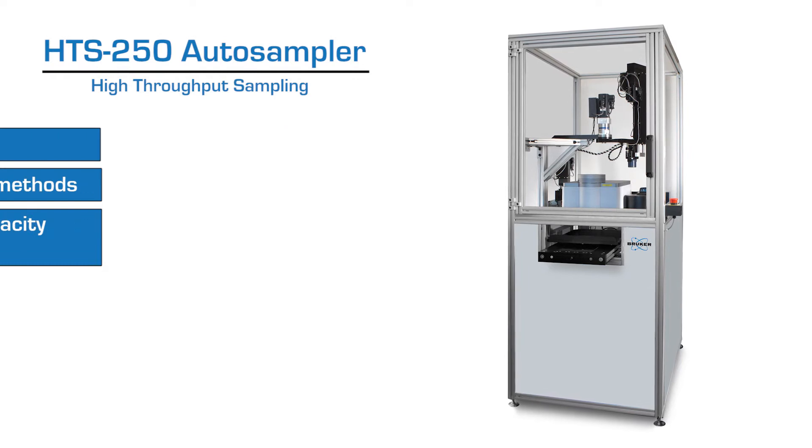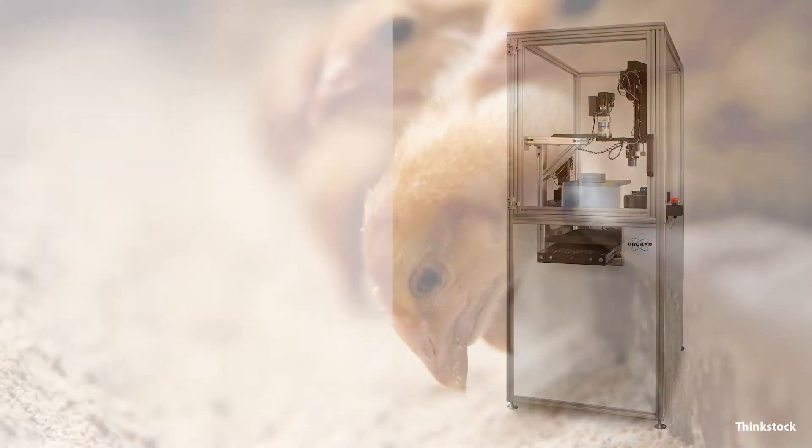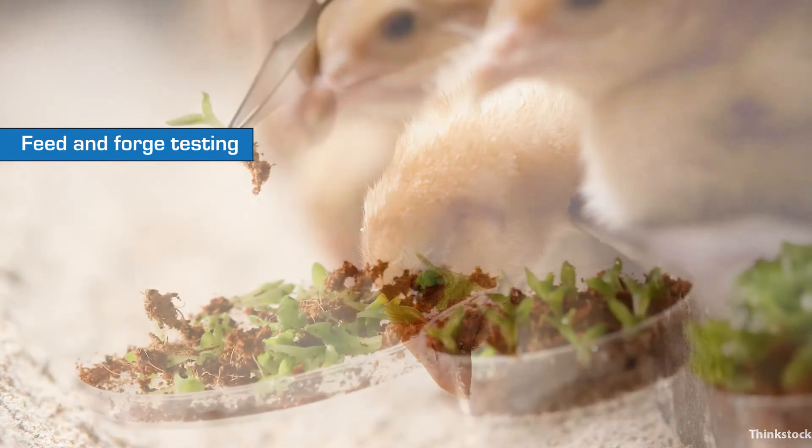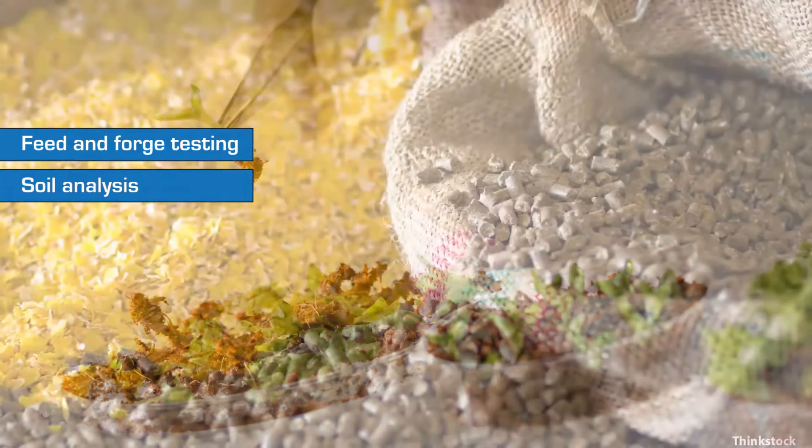The HTS 250 Auto Sampler can be used for a variety of applications such as feed and forage testing, soil analysis, digestibility studies, and mining industries.